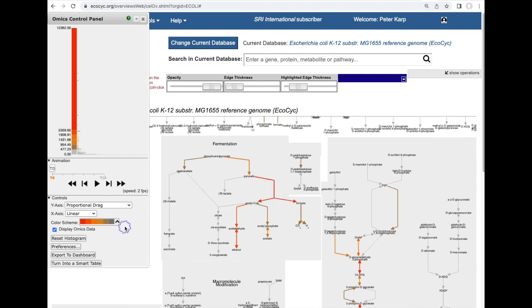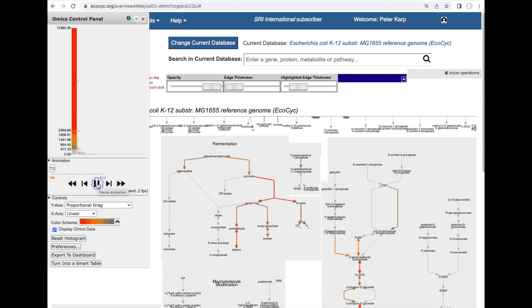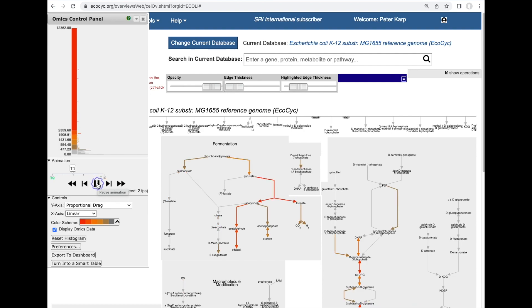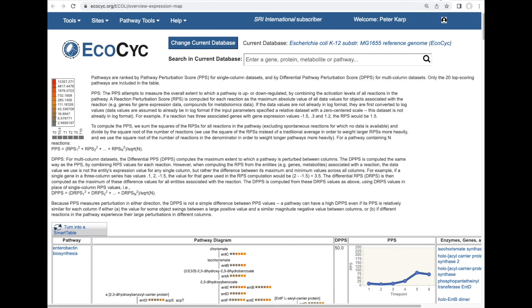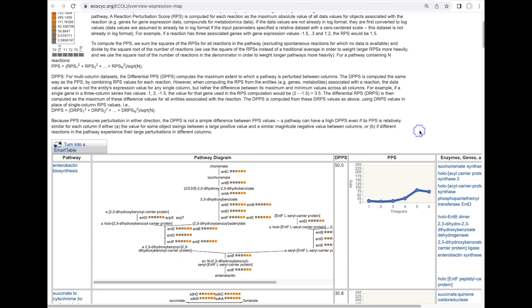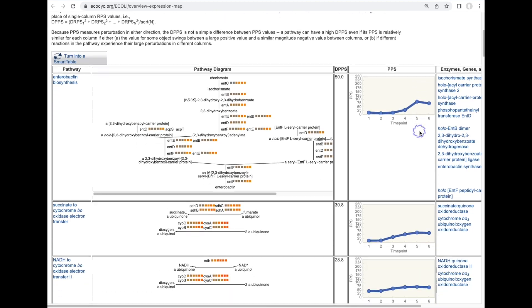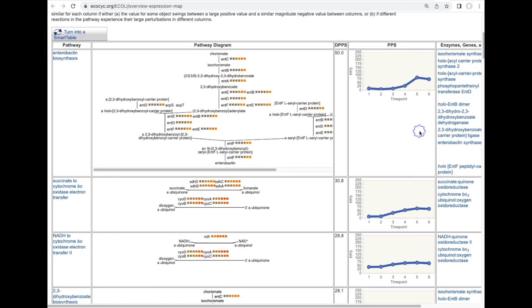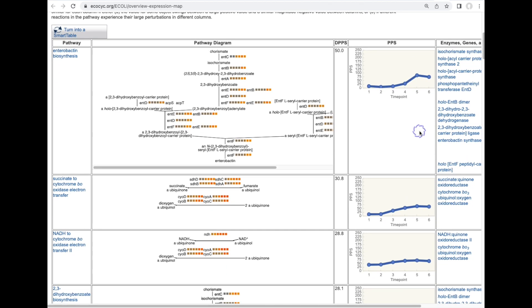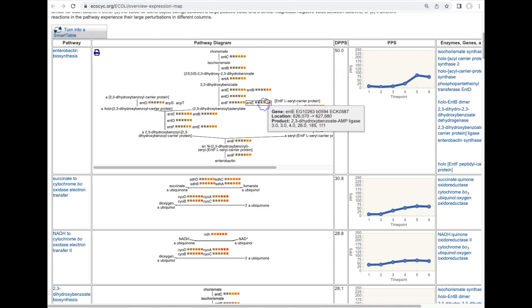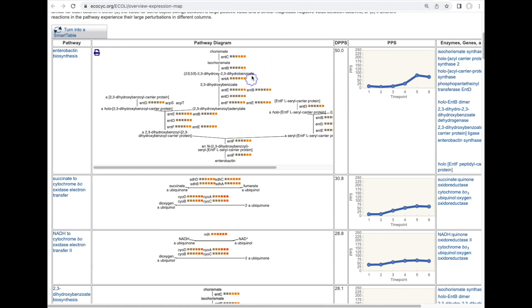Now we actually have six time points in this data set so I can turn on an animated display of this data and we can watch how over the six time steps the fermentation pathway gets down regulated. Another tool available is the software will produce a set of pathway diagrams sorted by their pathway activation level which again is computed from the underlying transcriptomics data. So we can see this is the most highly upregulated pathway in the set.